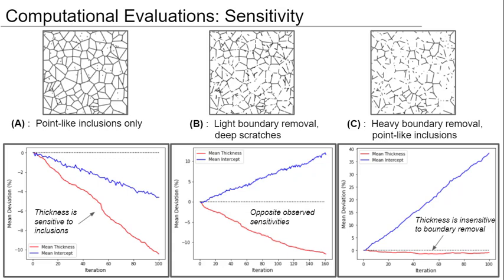The third one is more likely what I would see in a poor segmentation of Ti-6-4. It's made to represent missing boundaries, in this case probably missing alpha-alpha boundaries, and point-like inclusions, but at a lower density. It's very interesting here because the linear intercept method saw very great positive deviations because of the removal of the boundaries.